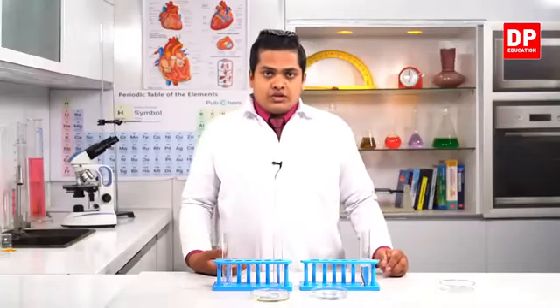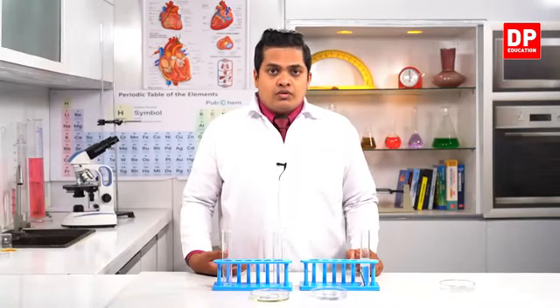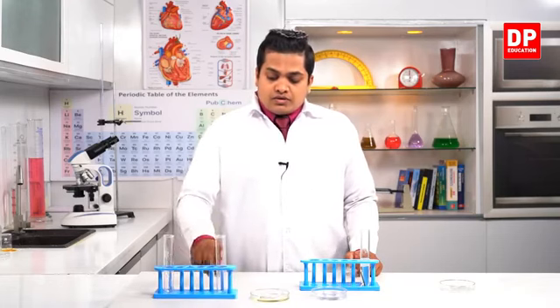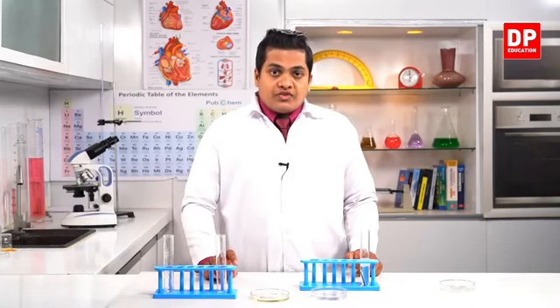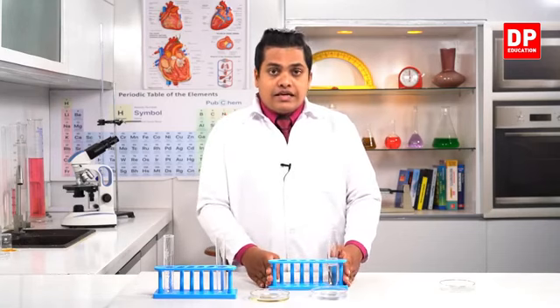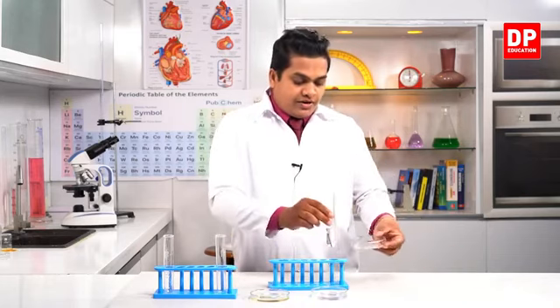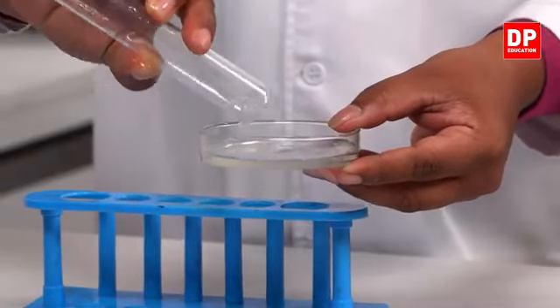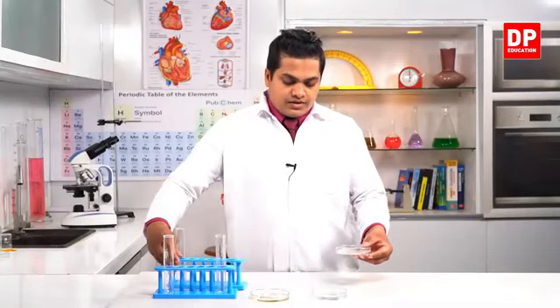Then I'm going to use the third and the final boiling tube. So I'll remove this one. This was the boiling tube which contains normal water. So this is the one which contains the boiled water. So I'm going to take the third Petri dish and pour this solution into it, and we'll see what has happened to the iron nail.